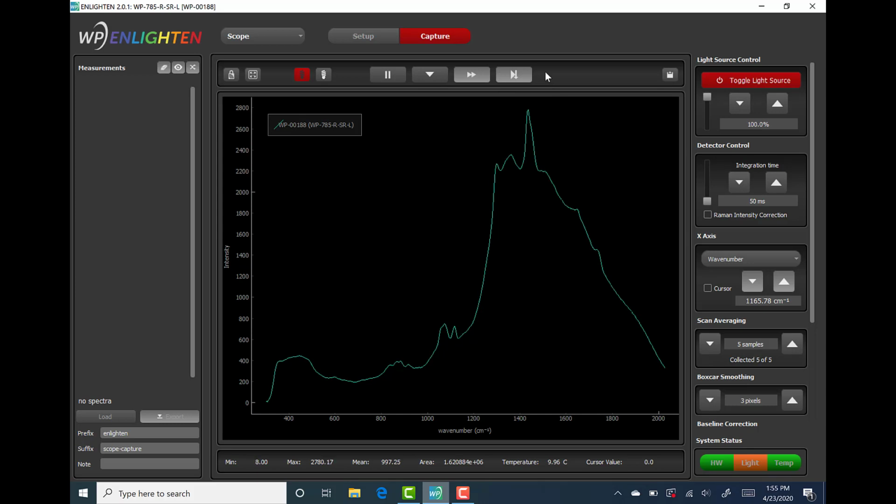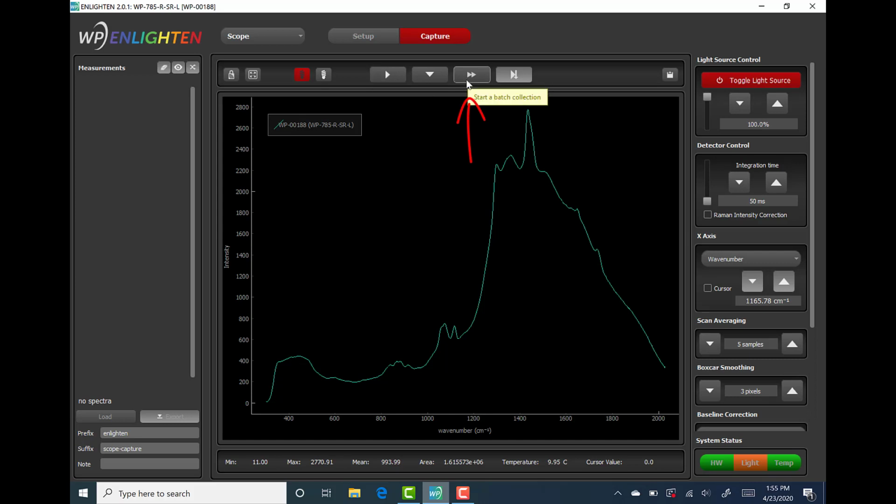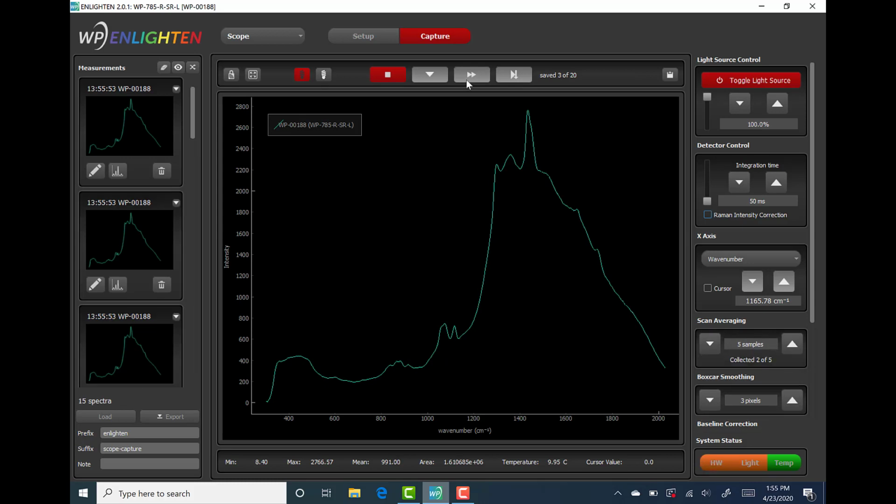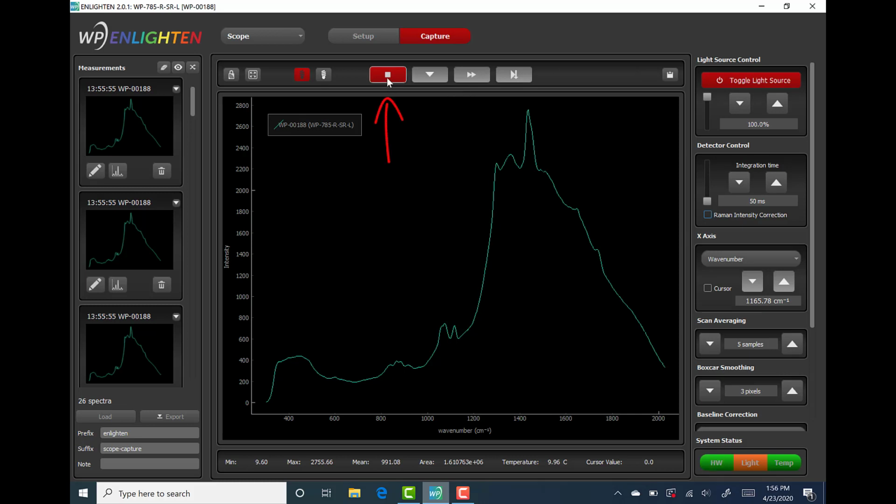However, the user needs to subsequently click the Pause button and then Start Collection button in Capture tab to start the acquisition. Once batch acquisition has commenced, the set of 4 VCR buttons change again slightly, shown here, where the Pause button is replaced by the Cancel Operation button. This function enables the user to abort batch acquisition once it has begun.